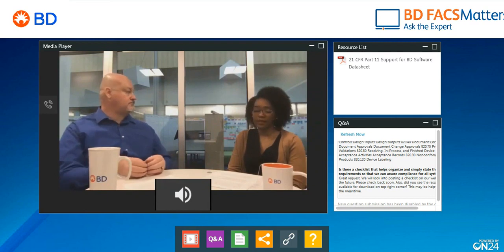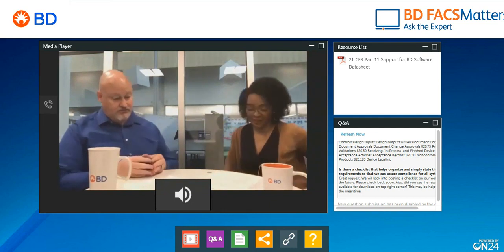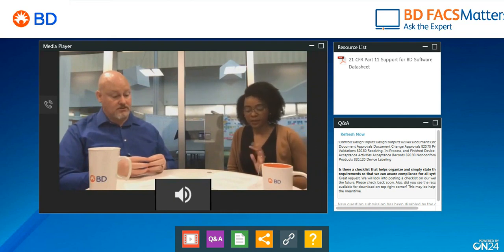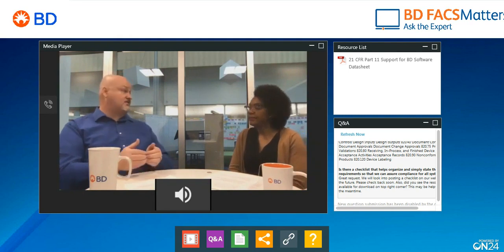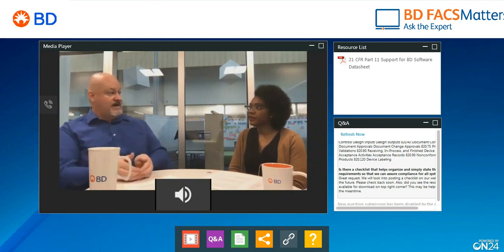Okay, so we have quite a few frequently asked questions that typically come up, and you've talked about some of them. But one of the first ones is regarding the audit trail. So if an audit trail can be turned off, does that mean that the system is no longer 21 CFR Part 11 compliant? That's actually a good question, because a lot of systems are designed so that you can either activate or inactivate Part 11 controls.